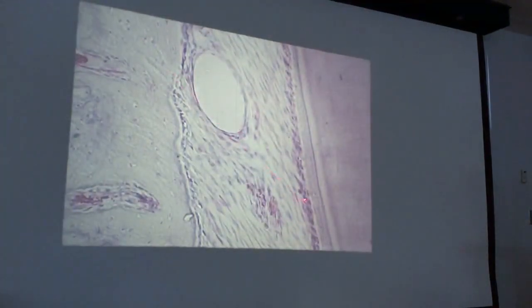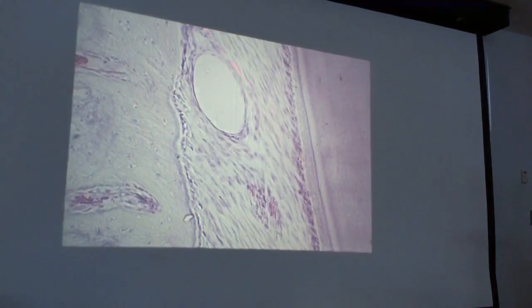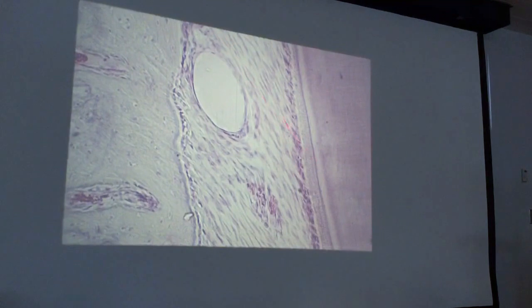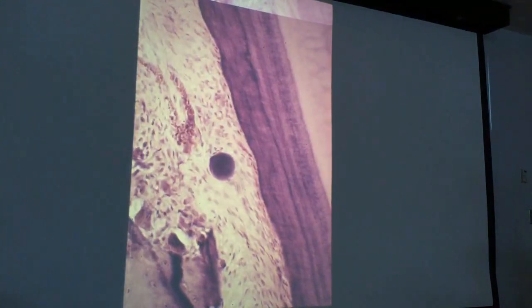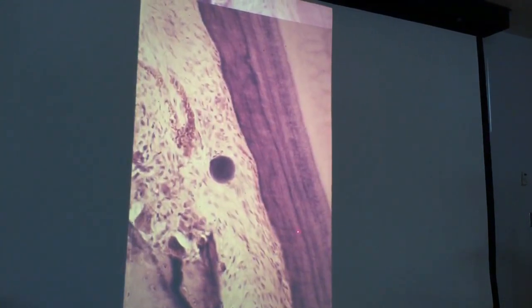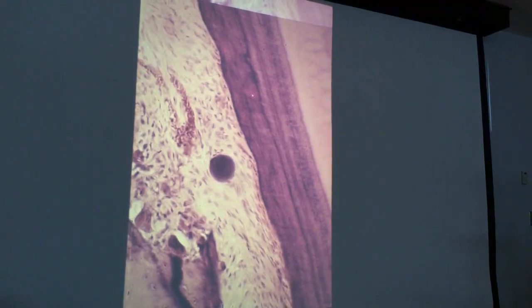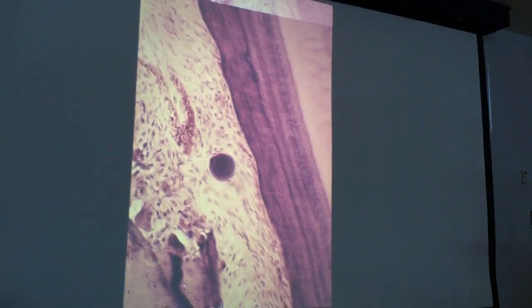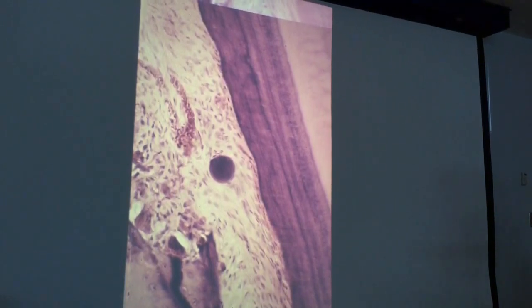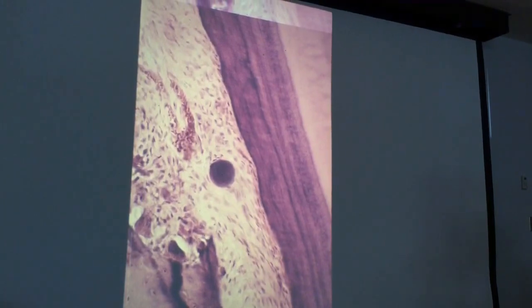And how about these fibers that we see right there? Oblique fibers. Dead giveaway the way that the pointer is going there. Okay, well, let's see. How about this tissue right there? What do we have? Acellular cementum, and what is this thing? Specifically, what is that? Free cementicle.